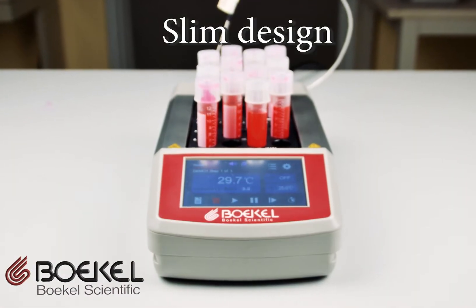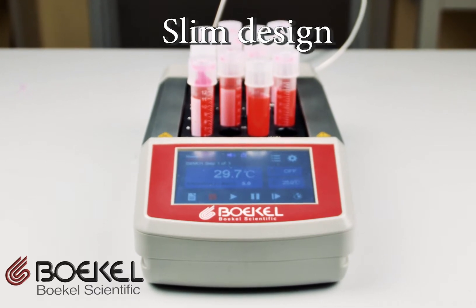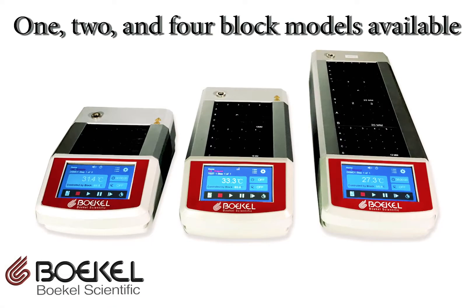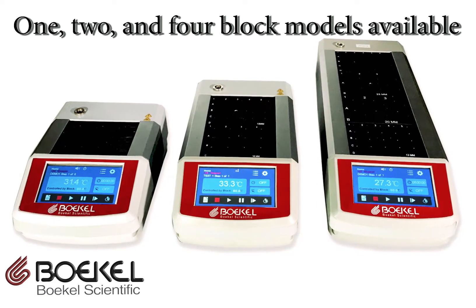The slim design allows for a large sample capacity while occupying limited bench space. One, two, and four-block models are available for ultimate workflow flexibility.